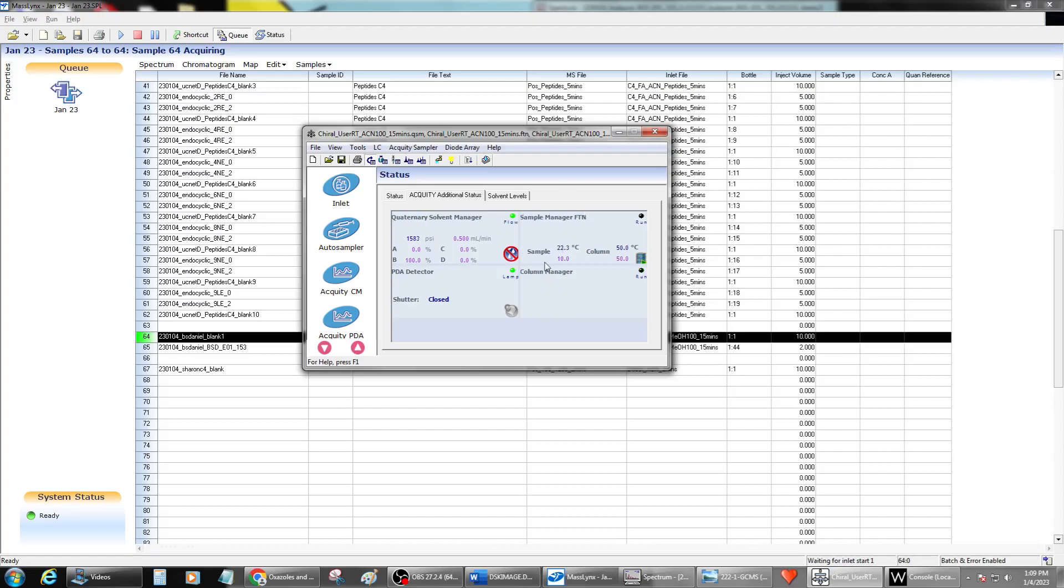But until I see that, I'm not 100% confident that it cleared the error. So if it didn't clear the error, the best thing to do is to pause the run. Here you go. You can see that it's washing the needle. So we're pretty much all good. So we don't have to worry about it anymore.